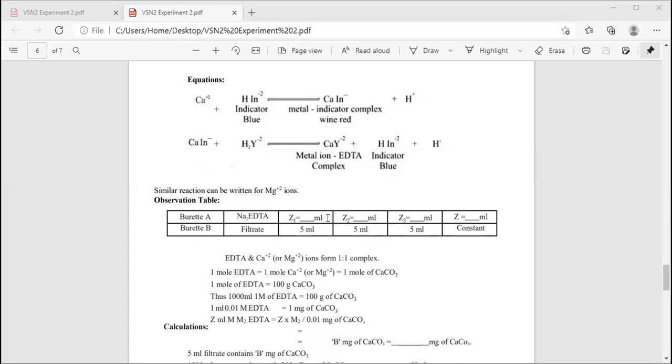Yes, everyone, I want an answer. Total hardness ज्यादा होता है क्या? Permanent hardness will be greater. Which one will be greater? Total, of course. So for total we got 3.2, so for permanent, should we get above 3 or below 3? Below 3. हाँ, so below 3, ma'am.